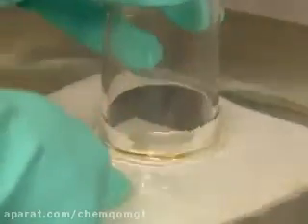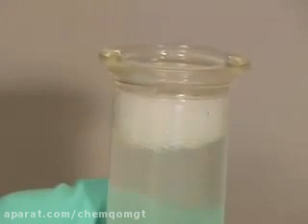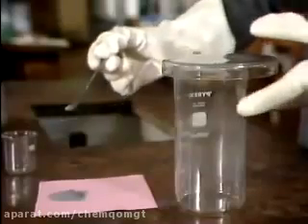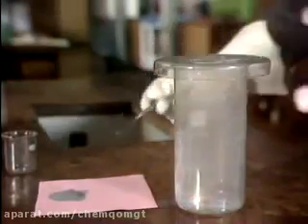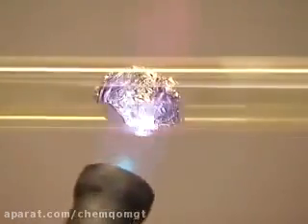They're also very soluble in water. Here's water swallowing a jar of hydrogen chloride. Now let's see how the halogens react with aluminium. When aluminium powder meets fluorine gas, the reaction's over in a flash. To get chlorine to react with aluminium, I'll heat some foil in a stream of the gas.